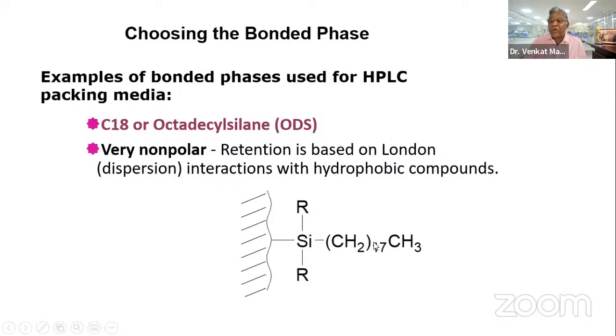So in liquid chromatography, the interaction will be with hydrophobic compounds. The compound does not directly dissolve in water. So the compound will dissolve, but it will not hit the surface. Depending upon the hydrophobic nature of the compound, you can provide the separation.